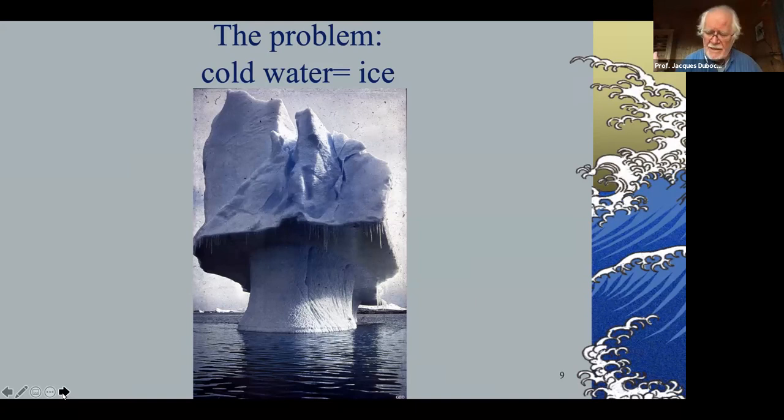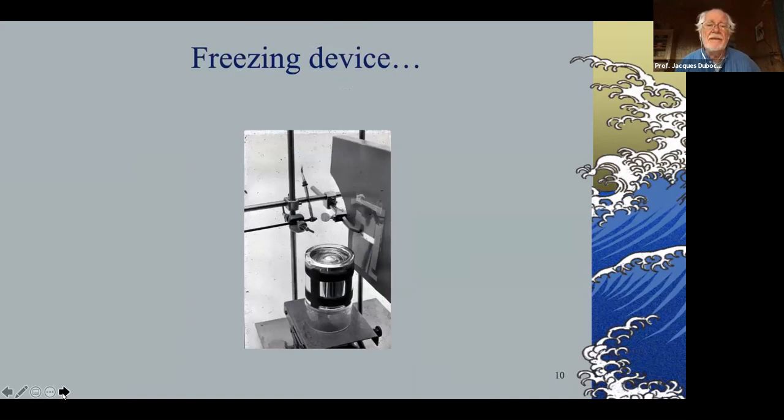So we tried to freeze and to cool by all kinds of means, using all our possible ideas to find something different. And so we had this extremely sophisticated machine. Don't laugh, be respectful. You will see it if you go to Stockholm and visit the Nobel Museum. And the machine is going like that. On the right side, there is a nebulizer throwing very, very small droplets of water through the slit.